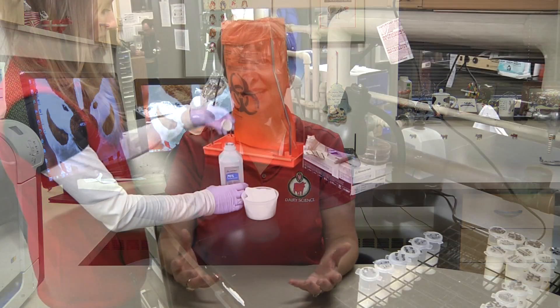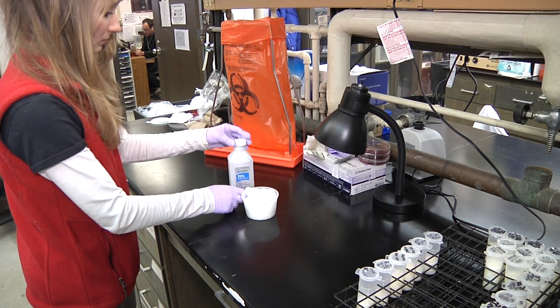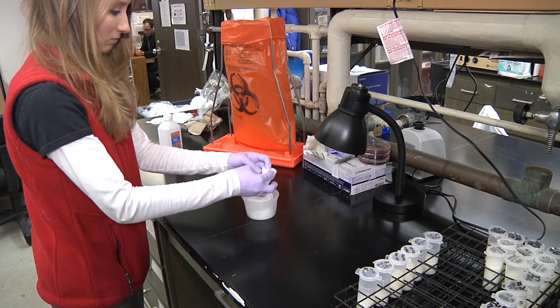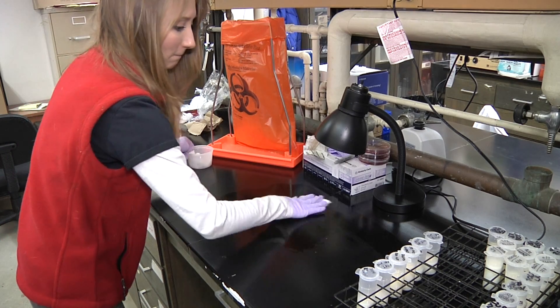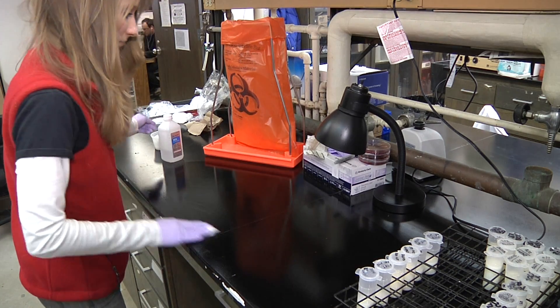After you get your supplies together, we need to clean off our workspace. We can clean that using either alcohol-soaked gauze or another type of commercial disinfectant wipe. Then we want to wash our hands and put on new gloves.